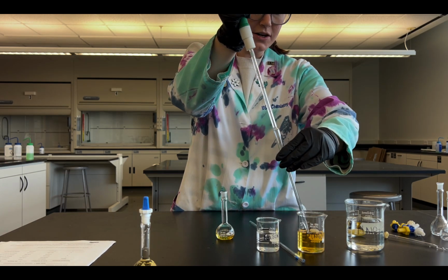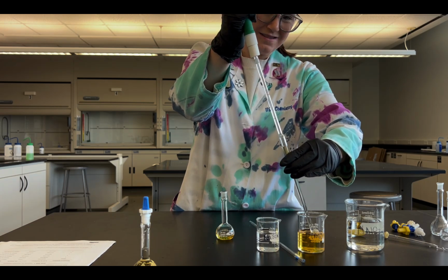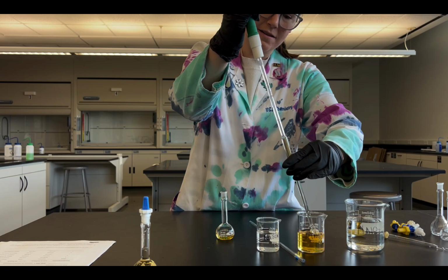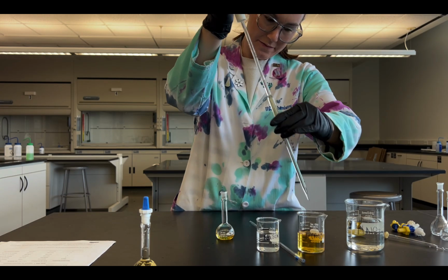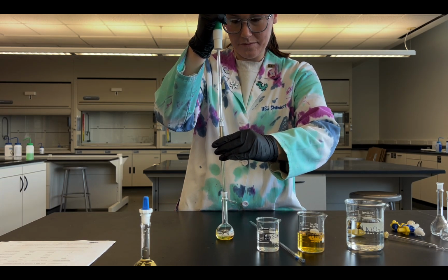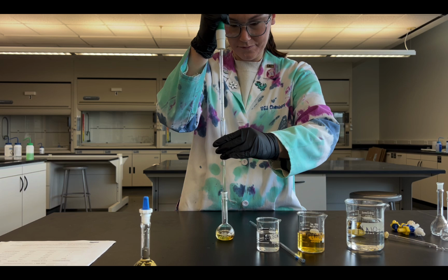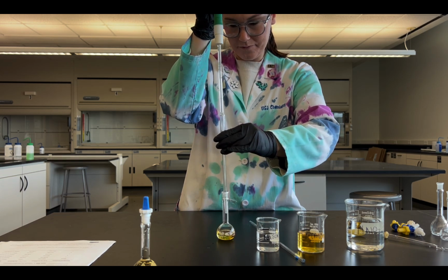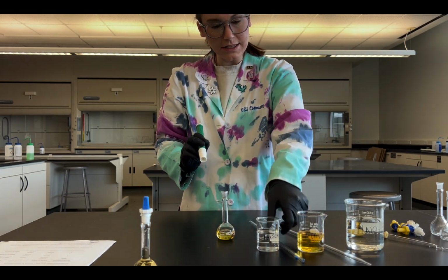So that's 5 milliliters. Another 5 milliliters, so that's my 10 milliliters of my iron nitrate.